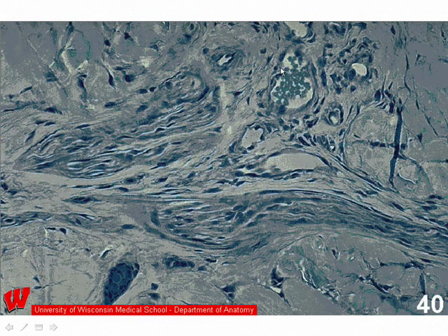Here is another lumen, also a blood vessel. Here's another lumen, also a blood vessel. Here's another lumen down here, which because of its appearance might be a lymphatic vessel. It's kind of hard to tell. And if we are uncertain about what structures are, we're never going to test you on them.